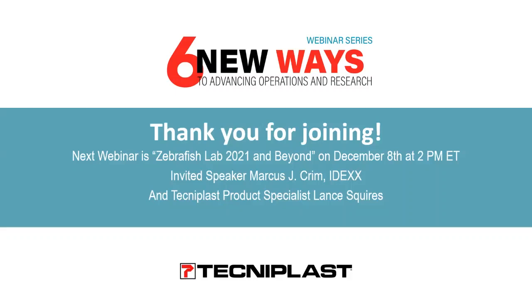So, Amy, you need to tell the system which cages you are using. So you need to register. This phase is very easy if you are using an animal management system, but if you are not, you can add the information manually. At the same time, when you finish using the cage for the experiment, for the breeding, for the stock, whatever, you need to tell the system that you are not using the cage anymore. You can do it with several steps. It is a very easy and fast task, and so the system is not taking care of that cage. I really hope that I gave you the answer.